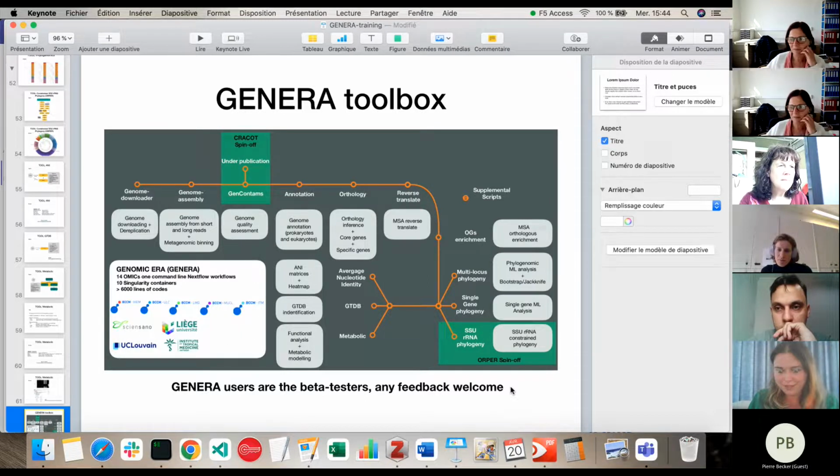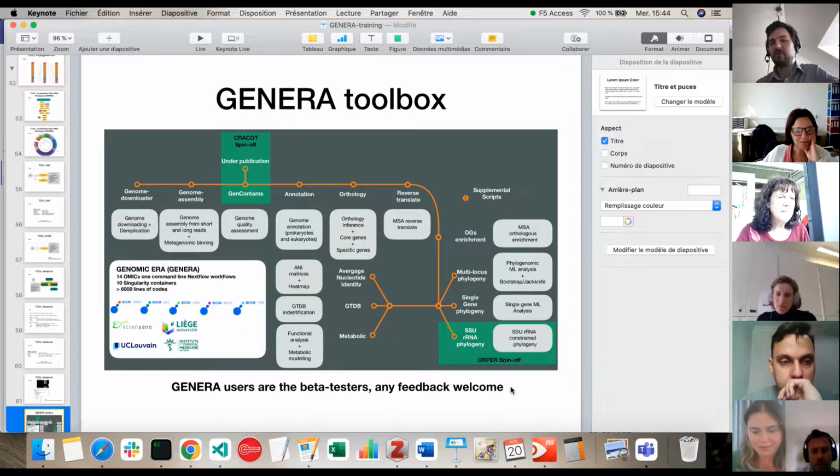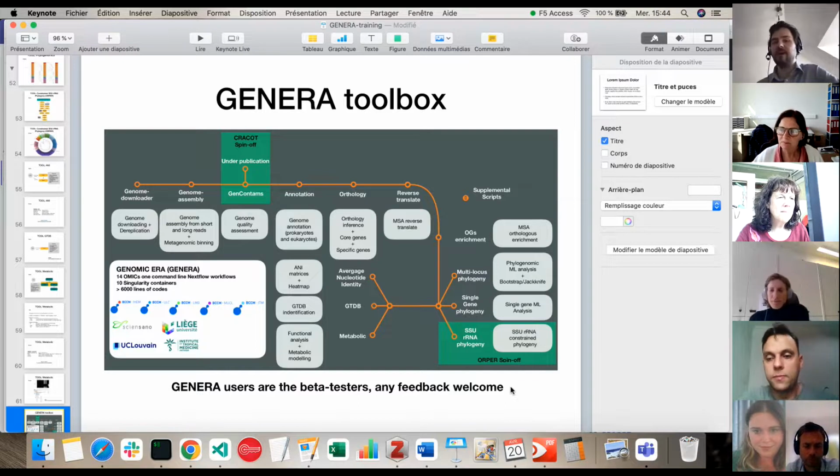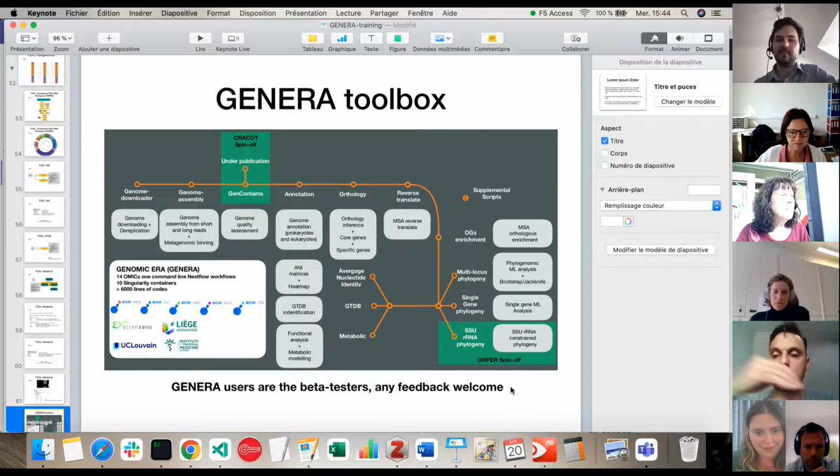So don't worry if you find something that doesn't work. I already tested all the pipelines, and other people also, but as I said, just a different naming of a file can crash the thing. How we will make it more resilient to naming is by testing it, of course.